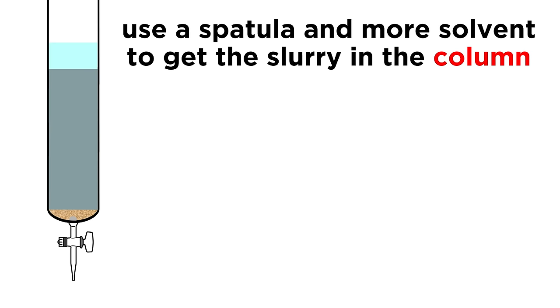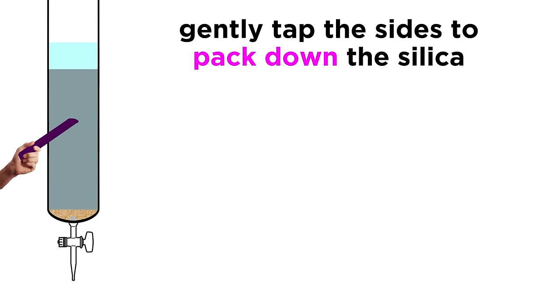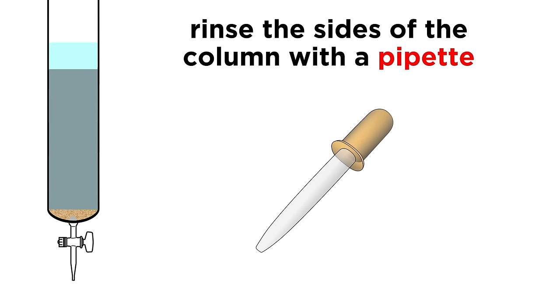It's a little tricky, but use a spatula to get it in the column, adding more solvent to the beaker as you go if necessary. Use something to tap gently on the side of the column until all the silica settles at the bottom, and use a pipette to rinse the sides with eluent to make sure it all gets down there.